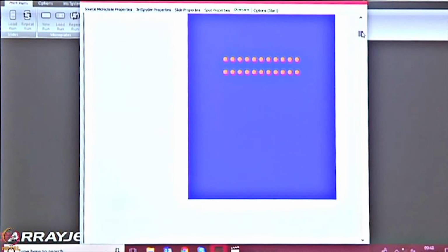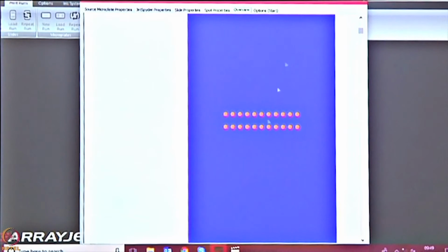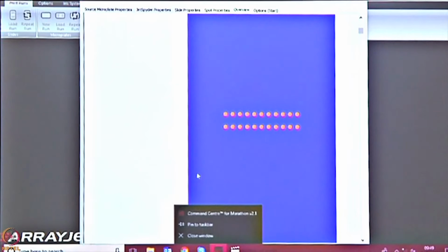So this is your one square. And now I have designed it, just while talking, in such a way that it looks pretty. It's good morphology and differentiated spots. So now you can tell that yes, this is something that I can work with, I can develop my assay. There could be many other biological samples that you can get in this square. So this is just one.